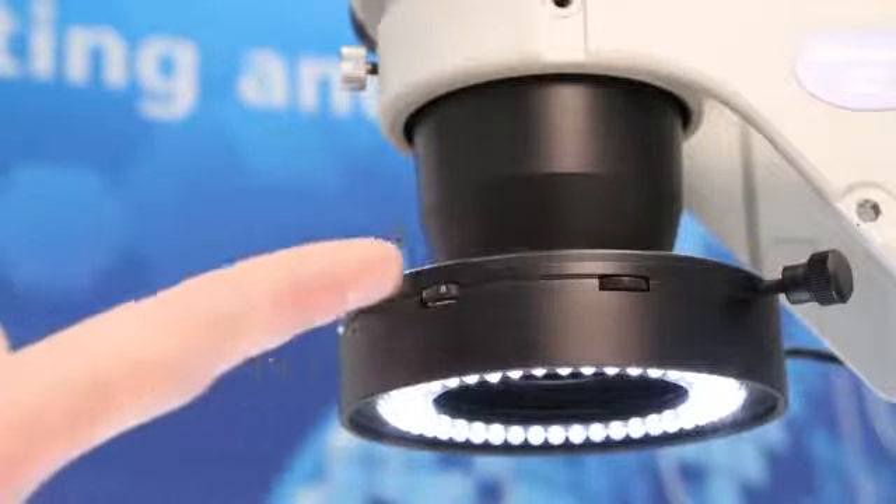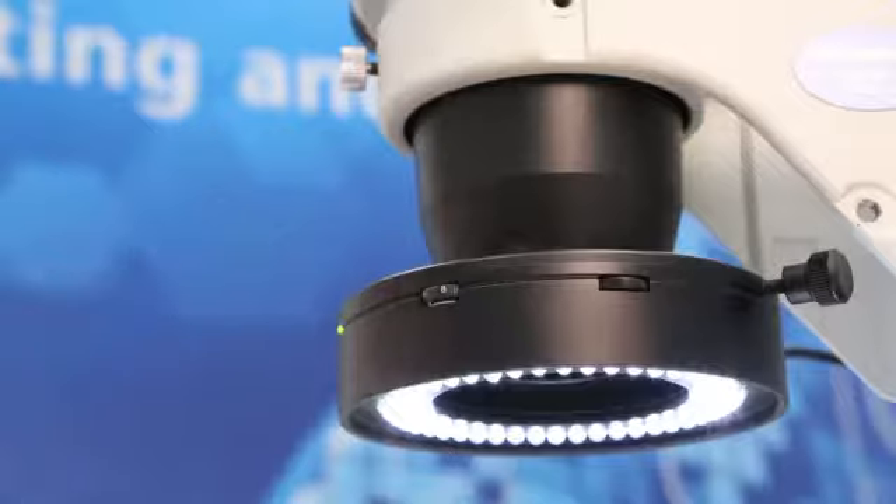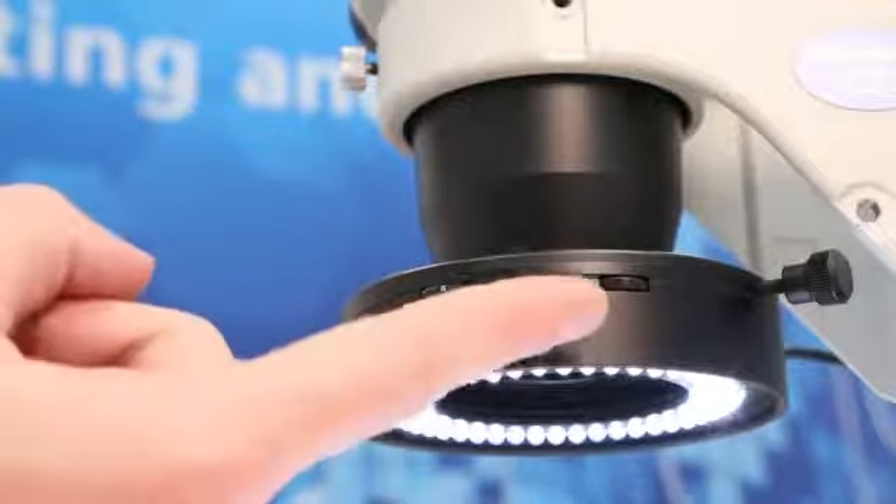Now you may recognize these functions from the EZLED Ring Light. However, the EZLED Ring Light Plus has an additional multifunctional control element which I'm going to demonstrate in greater detail for you now.